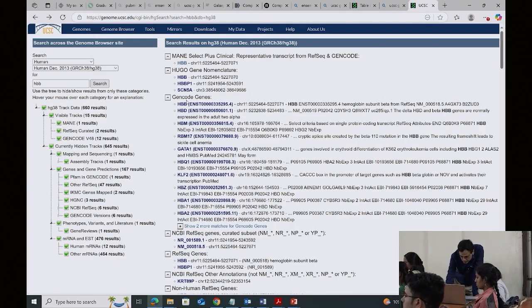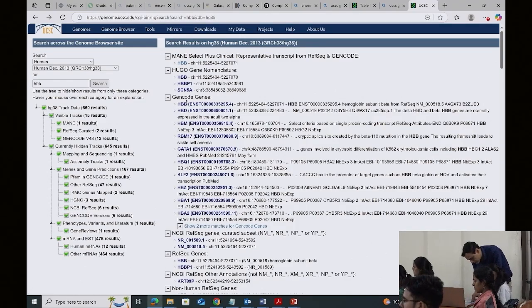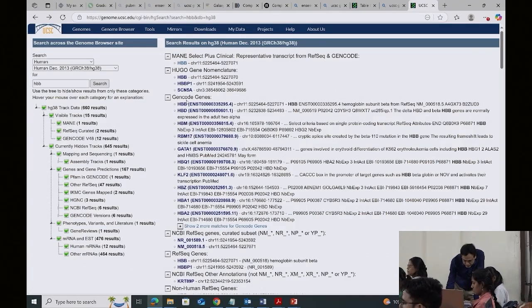So here it is, and you want to get the sequence, right? Are you doing this for sequence or which part of the question? The last one, gene on chromosome 11. Oh, list. Okay, then I think you are okay. But you have to have all of chromosome 11. So delete this and look up. So here it is, the start and end. Okay, and you can do RefSeq.